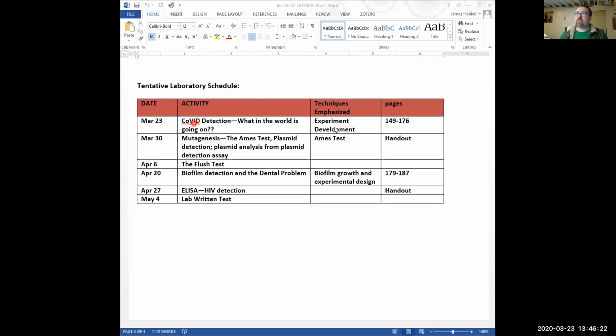So we're talking about, and I was going to talk about development of this, but this has been beaten to death, and I don't think people can deal with it right now. We have one group of people who are going to do the dilution series experiment. That's three people: Bree, Kara, and Alex, who I hope is not dead. Then we're going to go into the Ames test and plasmid detection. So that's going to be kind of two separate ones.